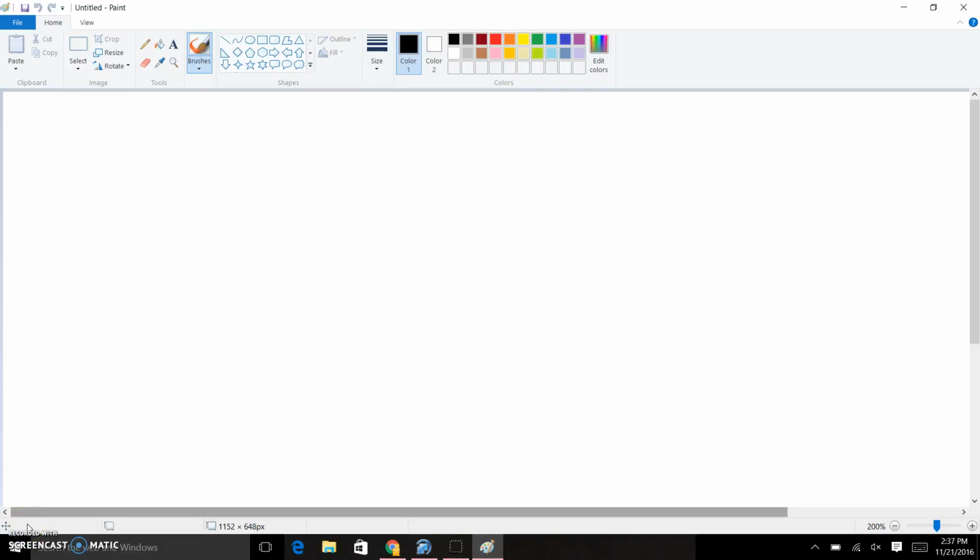Hi there, this video is about how to do box 1 and 2. So let's tackle box 1 and 2. Oh, I'm sorry, this is box 2 and 3. That's on your worksheet. Okay, so if you're looking at box 2, this is when you're using your ruler.